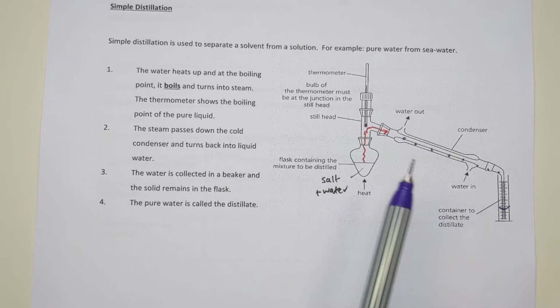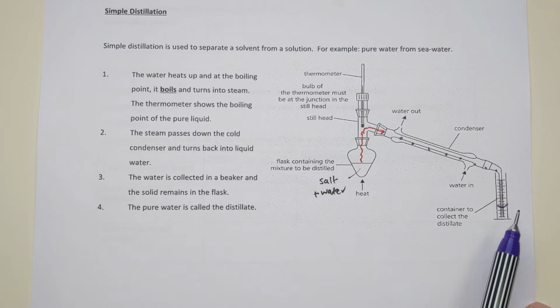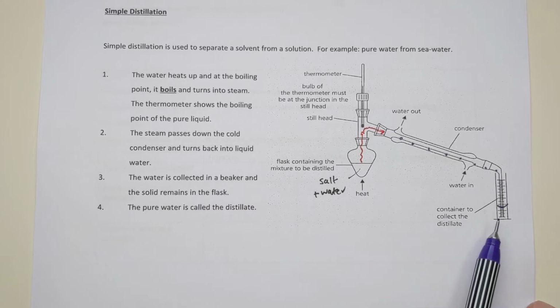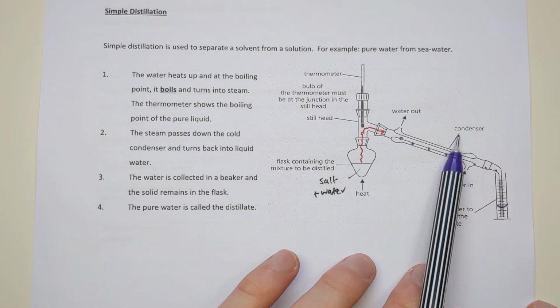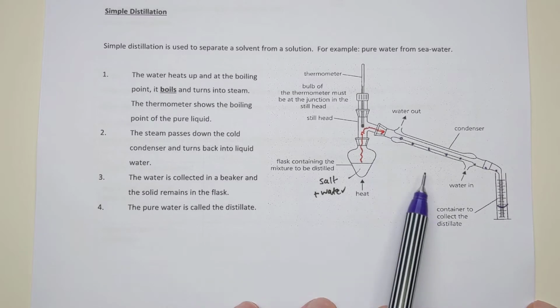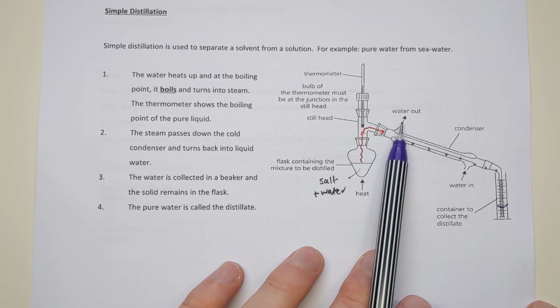A couple of extra terms here, just a fancy word we use to describe the liquid that comes out the end, a bit like filtrate and residue. The word we use in distillation is we've collected the distillate, the liquid that's come through the distillation apparatus. You have to know that this is called the condenser. You have to know that you put the water in the bottom and out the top. That just helps it fill up the container quite well. So in at the bottom, out the top.